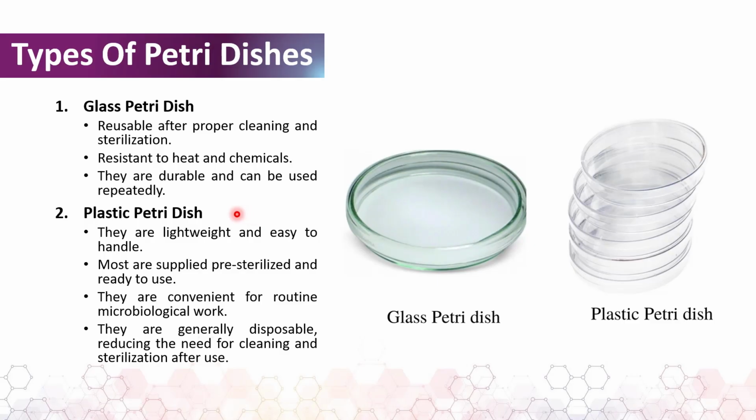And the advantages of the plastic Petri dishes are: they are lightweight and easy to handle, most are supplied pre-sterilized and ready to use, they are convenient for routine microbiological work, and they are mostly disposable to reduce the need for cleaning and sterilization after use.